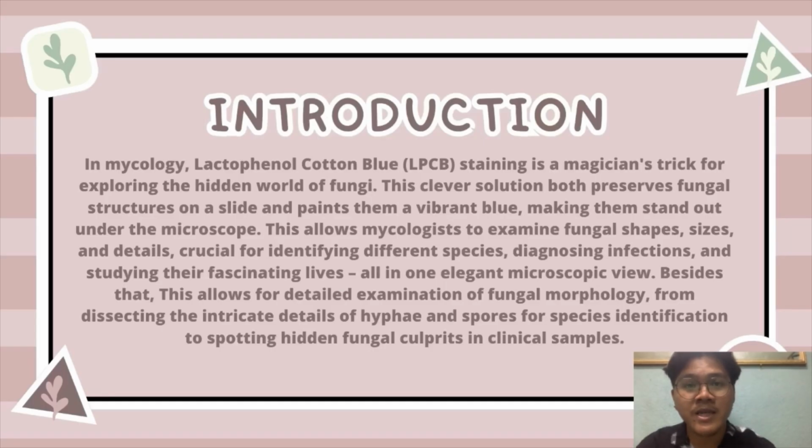In introduction, in mycology, Lactophenol Cotton Blue staining is a magician's trick for exploring the hidden world of fungi. This clever solution both preserves fungal structure on a slide and paints them a vibrant blue, making them stand out under the microscope. Besides that, this allows for detailed examination of fungal morphology, from dissecting the intricate details of hyphae and spores for species identification, to spotting hidden fungal culprits in clinical samples.